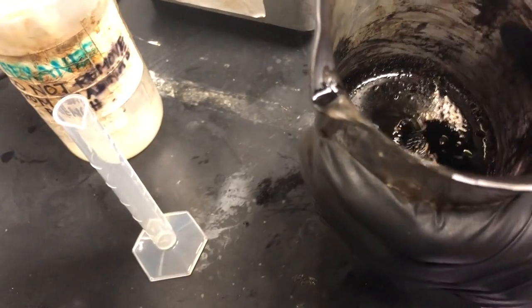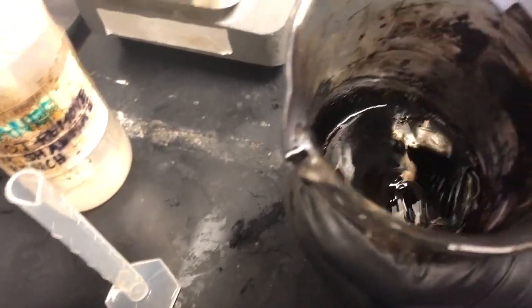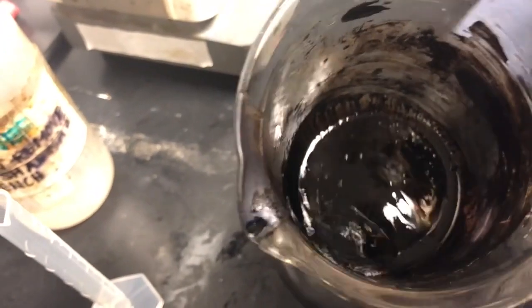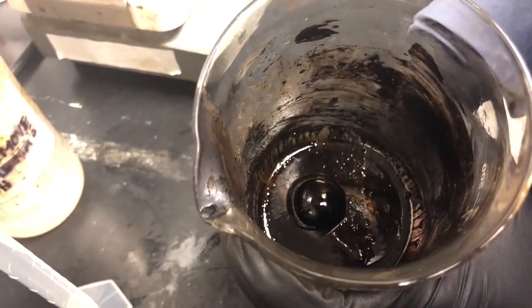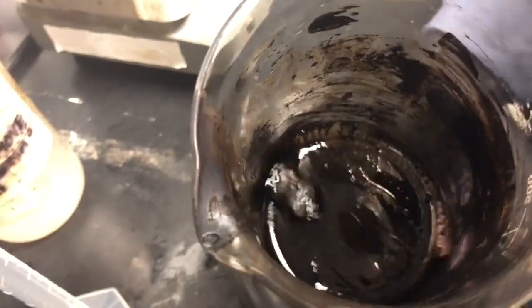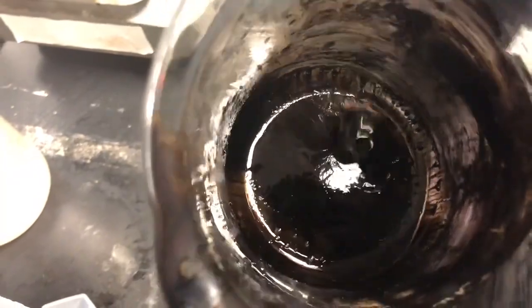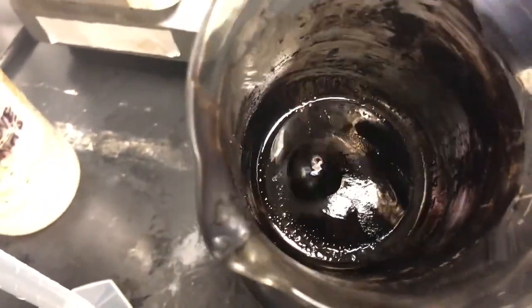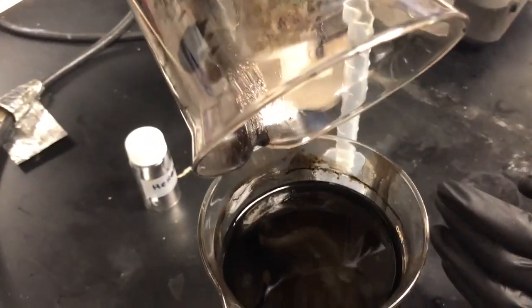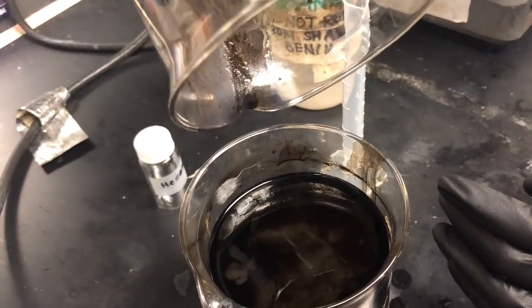So one of the final steps you can do is use the magnet to actually help mix it as well. And so you can see here, we have a pretty nice liquid. It's really dissolving up. But you can see some of the little dots that are crashing out. They look like little water or oil droplets. So those droplets we do want to remove, and that's the whole point of a lot of these washing steps. You'll see they'll come out as little clear droplets. So you see tiny ones right there.